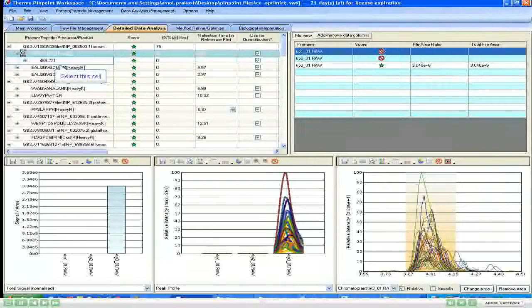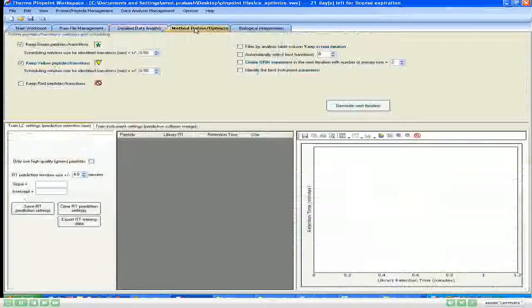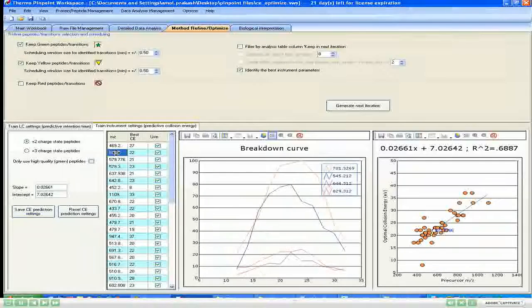Here's our run 2. Let's open that. This window is the precursor mass value, this window is the product mass value, and this window is the collision energy. So for example, for this transition, it has built-in possibilities 11, 13, 15, 17, 19, 21, and 23. And it has modified the product mass value just slightly so that it does not affect the data quality, but it will still be able to monitor 7 transitions or 7 possibilities for this transition without any problem.